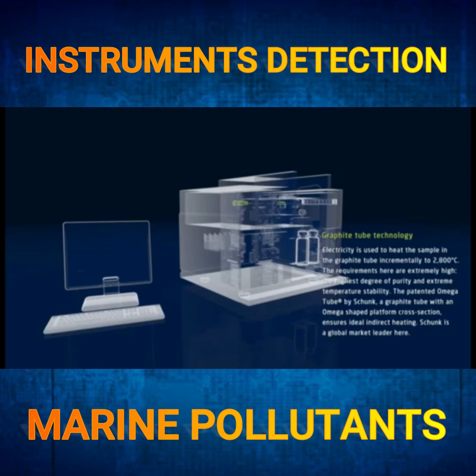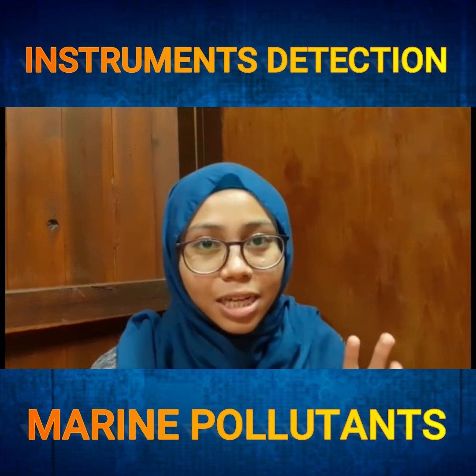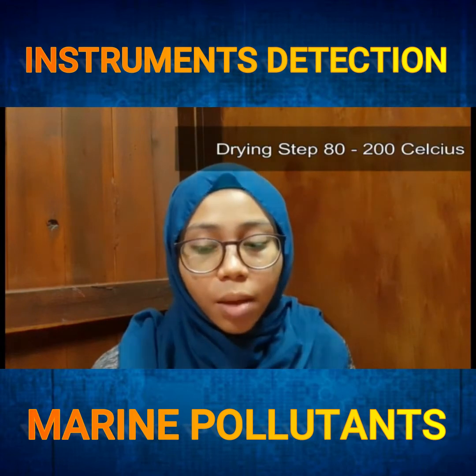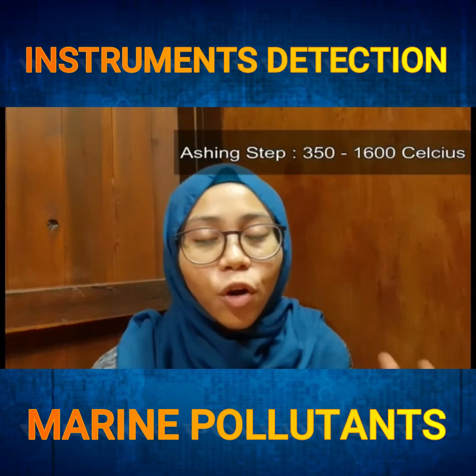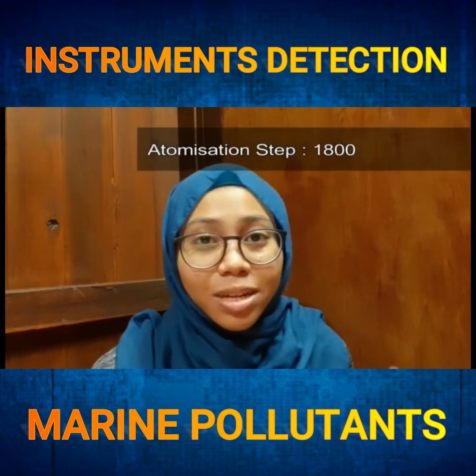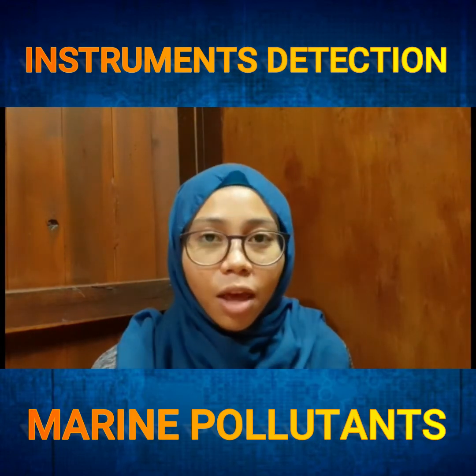So after the sample is placed on the platform in the graphite tube, there are 3 essential steps that happen in the graphite tube. First one is the drying step to remove solvent from the sample. The second one is the ashing step to remove organic and inorganic material. And the third one is the atomization step, the generation of free analyte atoms in a cloud.